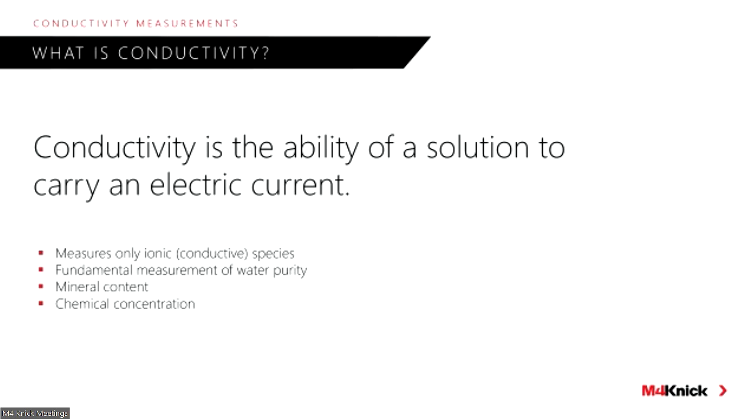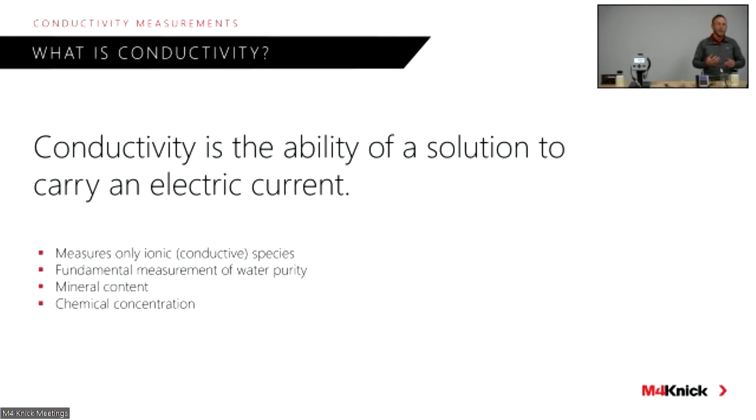Those of you that are working in a semiconductor facility probably know a lot about resistivity measurements. TDS, total dissolved solids, salinity, all based off the principle of conductivity measurement. So that's also something that's often overlooked: simple conductivity electrodes are used for a number of different measurement parameters out there.